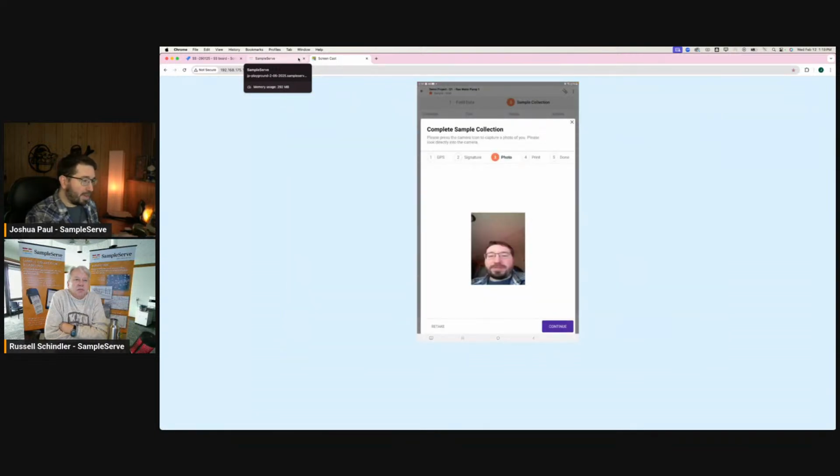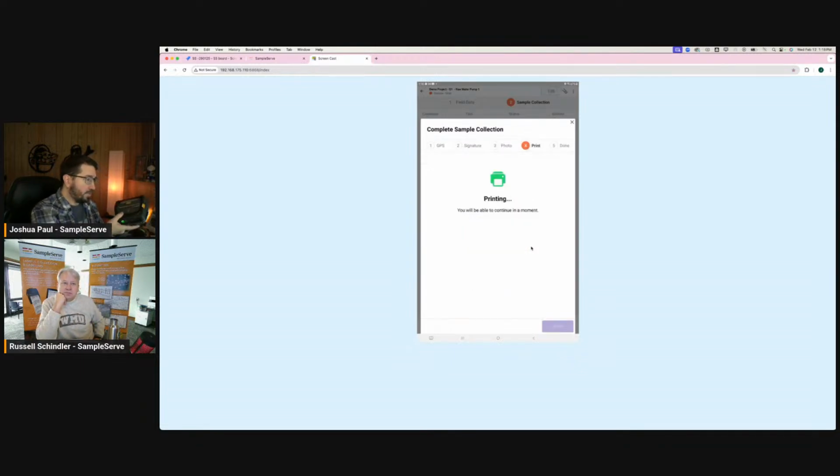So you can see my little selfie here that I took, and this selfie will show up on your sampling reports as well, so you know exactly who took it. So I'm going to hit the continue button here. I have my printer shown right here. It's going to print out that sample bottle label that I have. Now, if I have 4 or 5 bottles that I filled up, it'd print out 4 or 5 labels for the bottles that I had connected to that test.